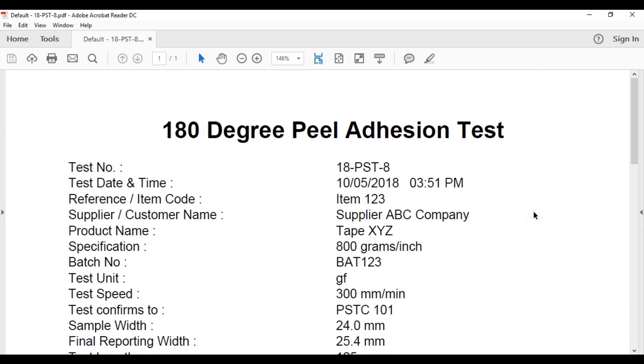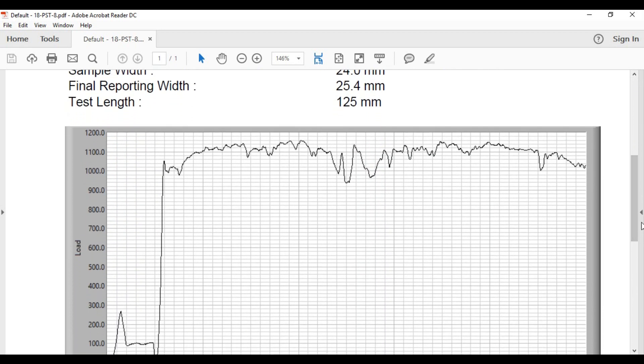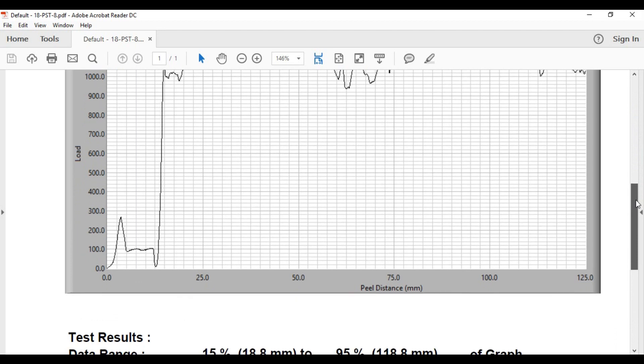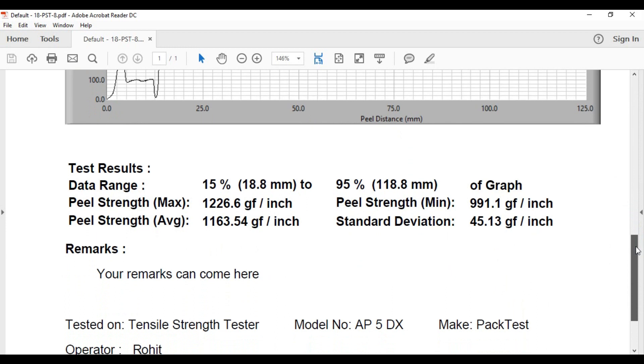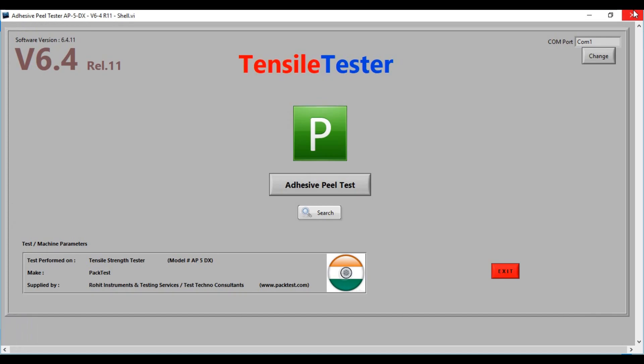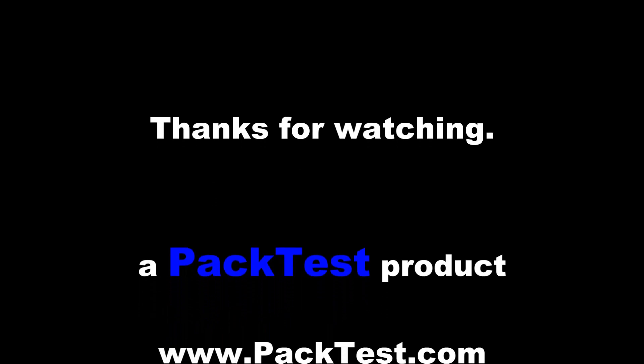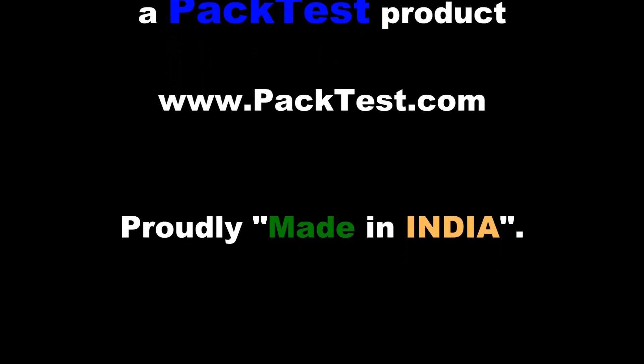A PDF report is generated and shown on your screen.